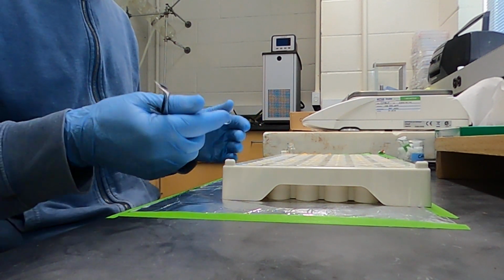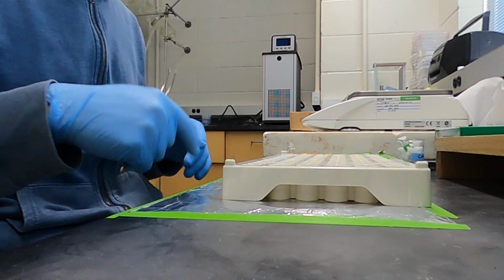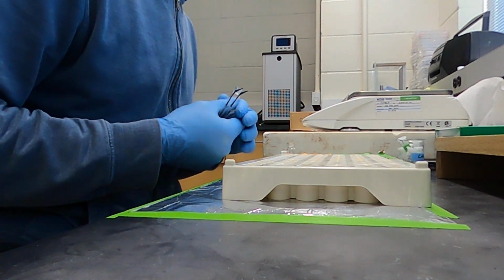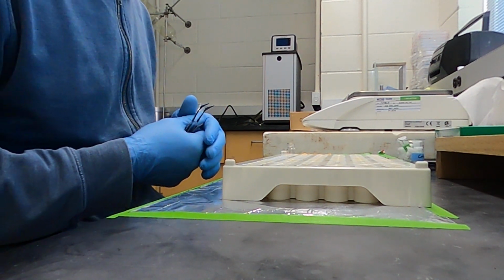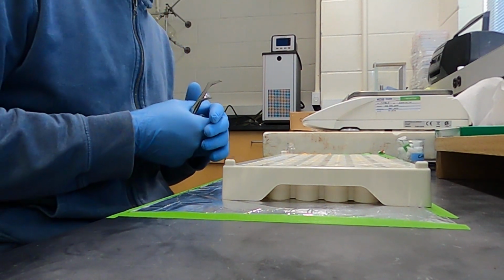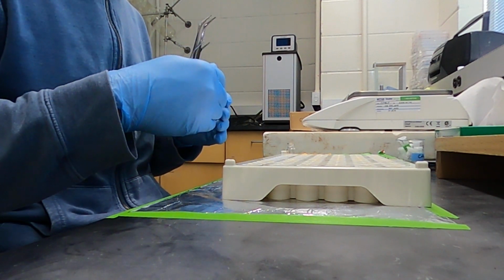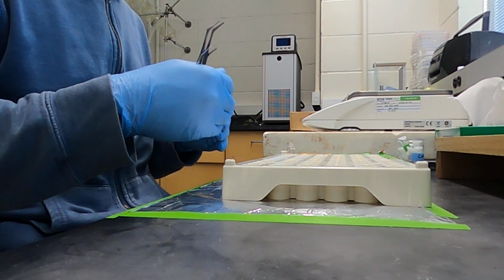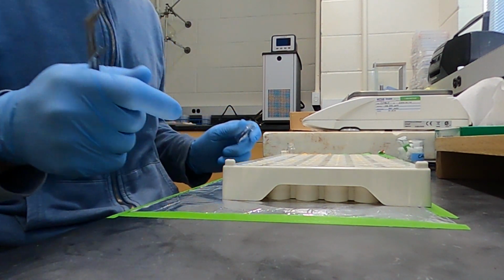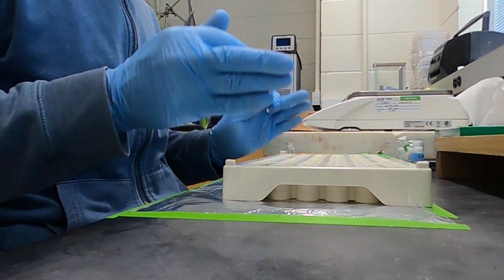And then we'll obtain a delta value that changes with weight, and well, it's part of the data processing, but the idea is you do some kind of a regression line or something like that, and you see how it changes with weight, and then you're able to correct. That's the principle. So that's how a tray for that type of measurements is made.